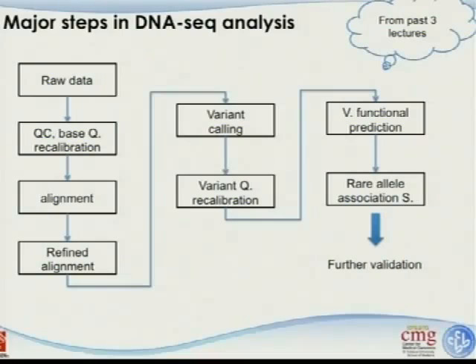But if the design is not balanced, if we are doing cancer somatic DNA, which means only a small portion of the cells has that mutation, or if we are doing pooled DNA sequencing, which means only a small percentage of people in that pool has that variation, or if we are doing RNA sequencing, where one of the alleles is not as much expressed as the other one, that is still a diploid genome, but it's not going to be a balanced design anymore.